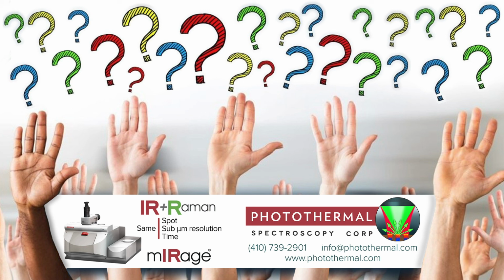We could, for example, try to isolate amyloid proteins and do elemental analysis of amyloid-beta isolates. However, the samples would be processed, and we could lose structural information, and we could lose metal ions.